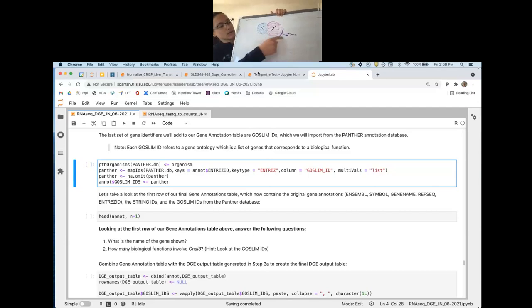And so then we introduce this biotinylated antibody into our cell system, right? Of course, we have to bust open our cells to do this. And then we add in this antibody, and when it bumps into Y, it's going to latch on. And then we use the magnet to pull it down. And then we can do a protein assay, like gas chromatography mass spectrometry, liquid chromatography, or a Western blot analysis. There's a variety of different ways to assess the proteins that are in here. And then we could see all the binding partners of protein Y. So then we can identify that protein X is going to be one of its binding partners.